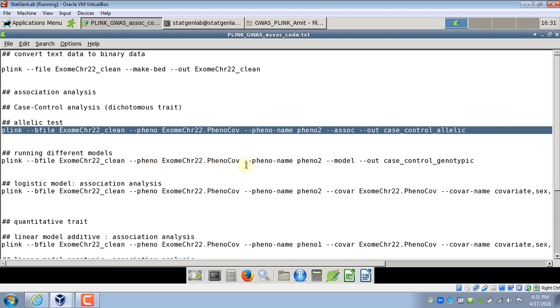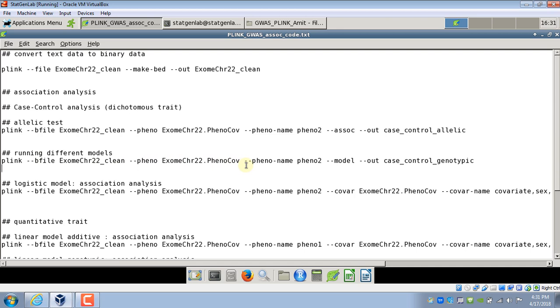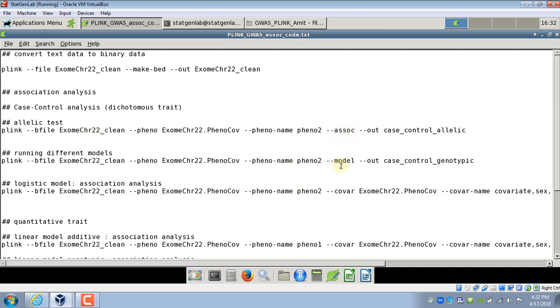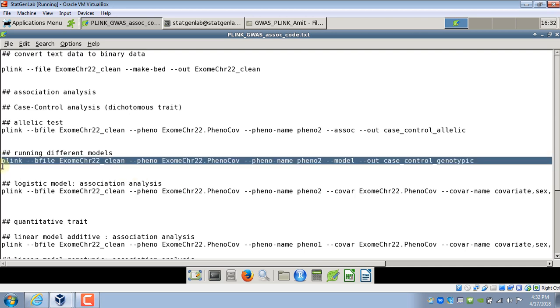Now if you want to perform different tests and run different models there is option called minus minus model instead of minus minus asop which will perform more number of tests on the SNPs. Like you can run recessive model, additive model, genotypic model, dominant model and they all will be performed just with this one option. So everything else keeping same I will just change minus minus asop to minus minus model and rerun the analysis.